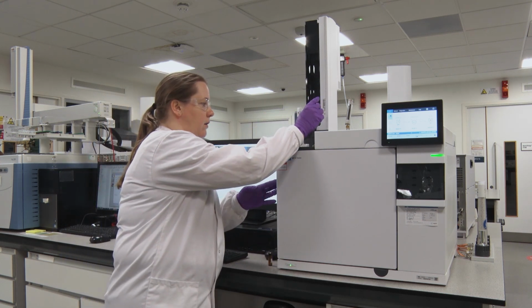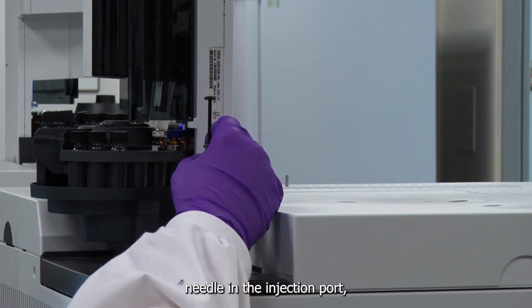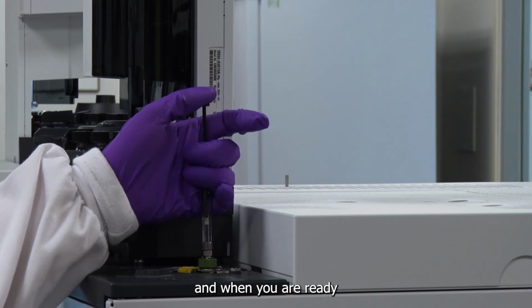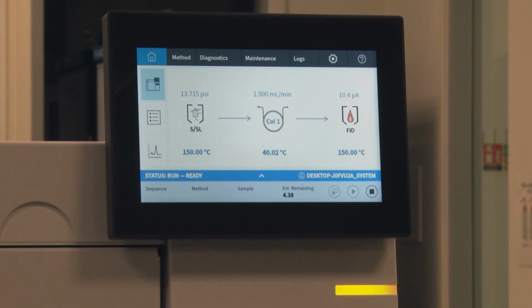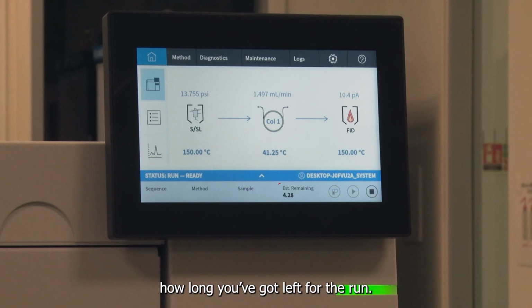So you put your needle in the injection port, and when you're ready you press the plunger and press play, and then take the needle out. And now your run is going. The GC will tell you how long you've got left for the run.